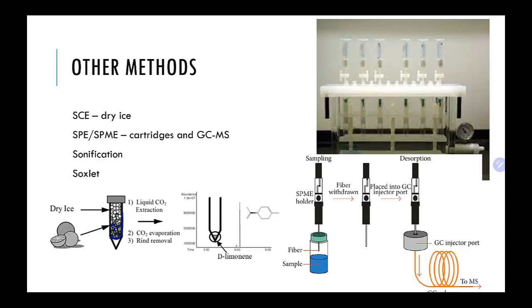You put this whole tube in warm water, not hot water, but warm, and once you get to a certain temperature, the dry ice is going to start boiling, but because of the cap being on, you'll develop a certain amount of pressure, so you'll increase the pressure while you're increasing the temperature, and we'll get to a point called a triple point.